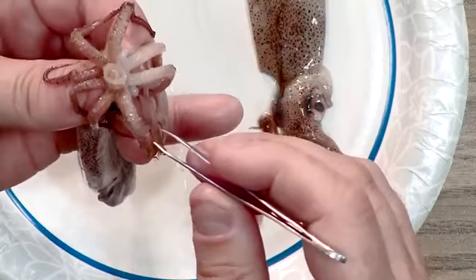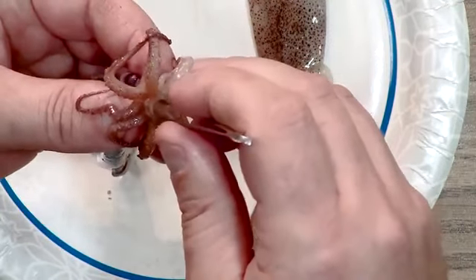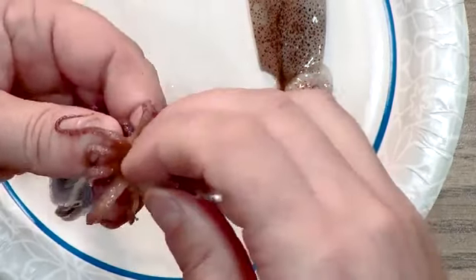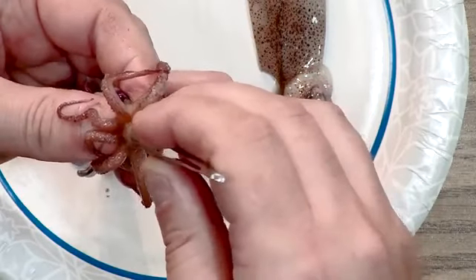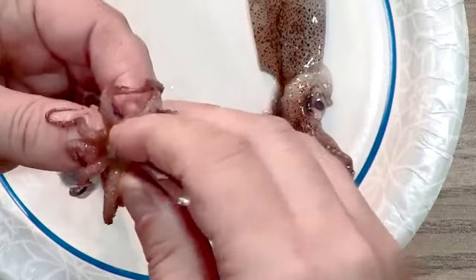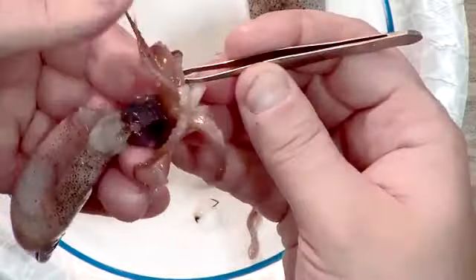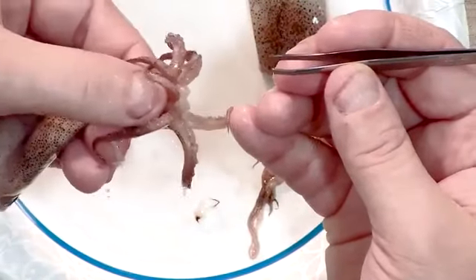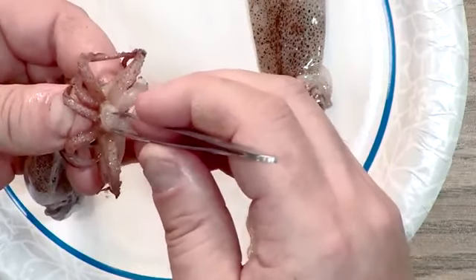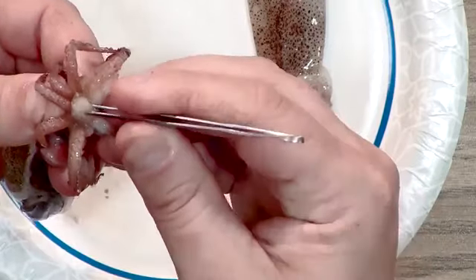And now that the black is gone, there's a white bulbous shape in there. I'm going to push in there on both sides and see if I can grab this without tearing it. A technique that I use is on the side here. I'm pushing a little with my thumbs to expand out that mouth region and let that white object pop out.